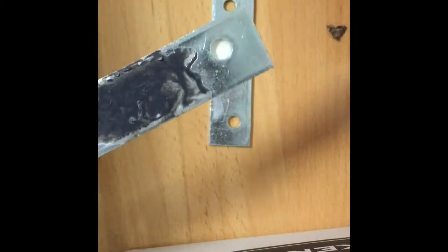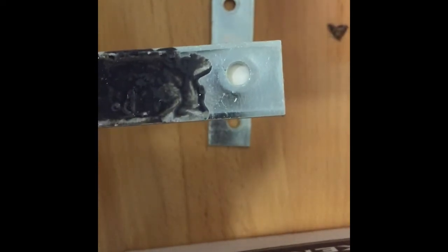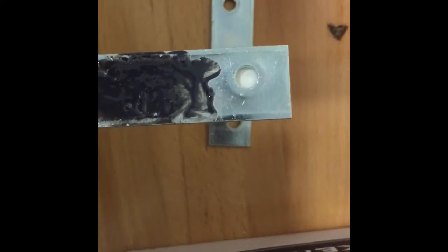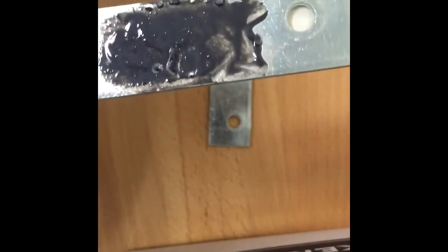Sample B had 3 parts resin, 1 part diamine. Notice that is still very predominantly, I don't want to touch it because it's got some in there and I'm not wearing gloves. But notice that you can still see that it is fairly liquid where the resin is because it has not interacted very much with the diamine. It simply has not been able to cross-link properly because there's been an excess of the resin.